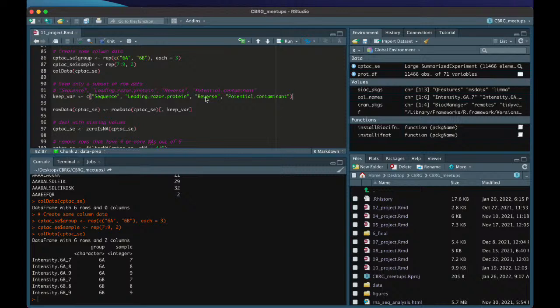And this is because a lot of these peptide sequences that are picked up don't actually correspond to any actual protein. So this is one way of getting rid of what are called these reverse hits. You can consider this as noise.